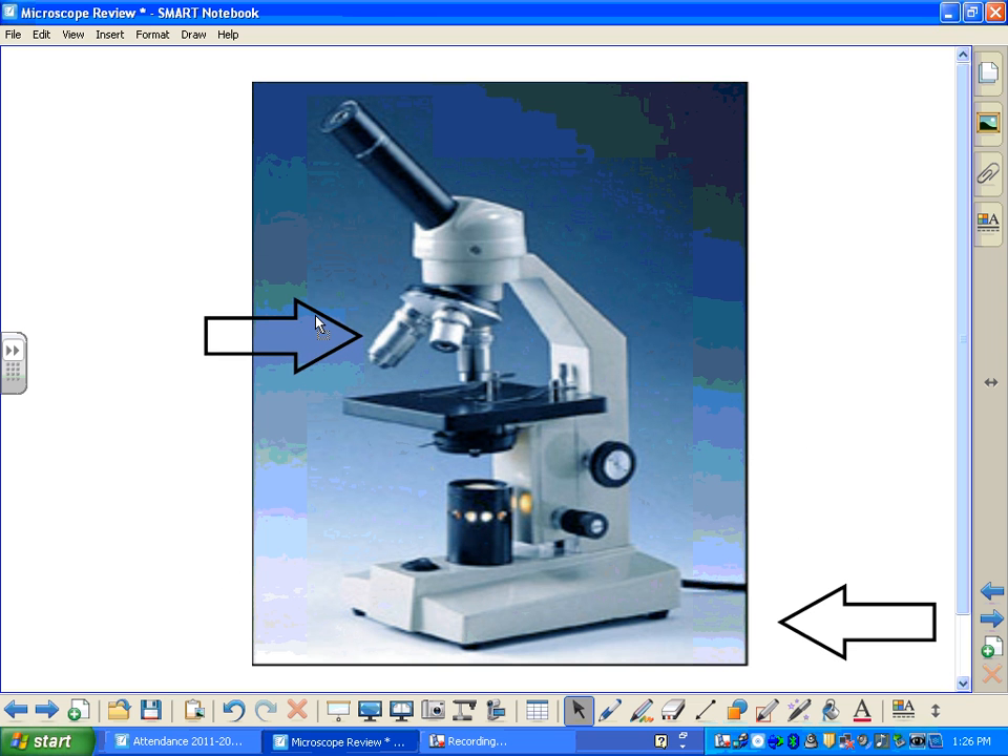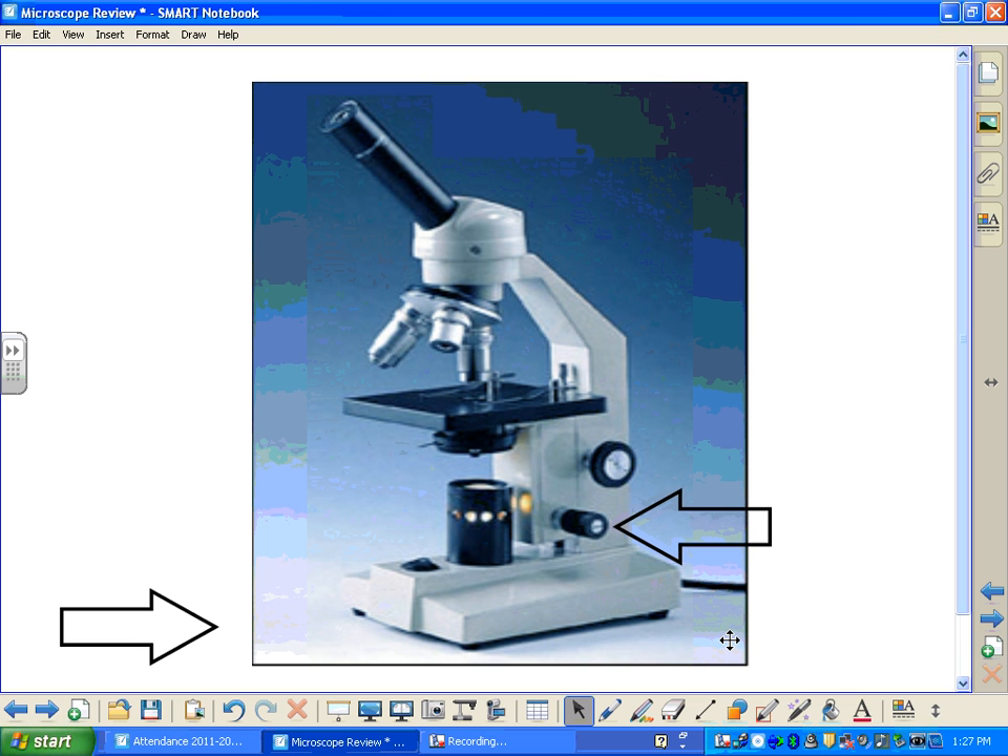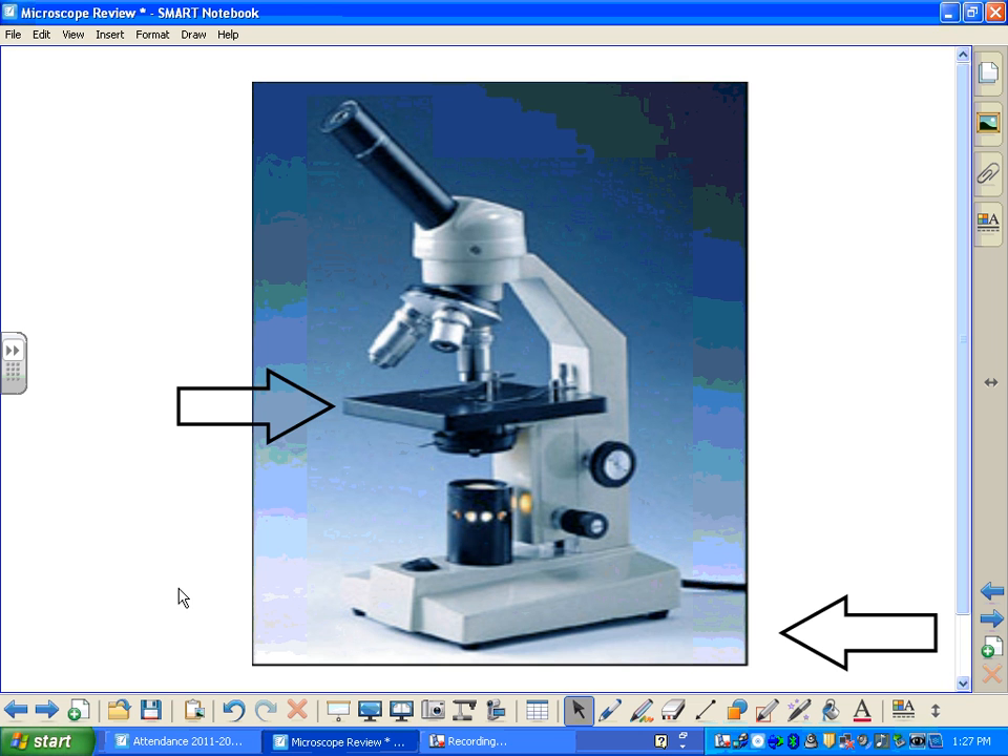Question number two: what is the name of this part of your microscope? It's the longest of the three pieces here. Question number three: what is the name of the piece you look in? Question number four: what is the name of this knob? Question number five: what is the name of this work surface where you place your slide?